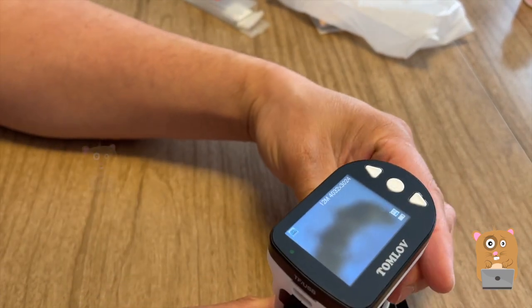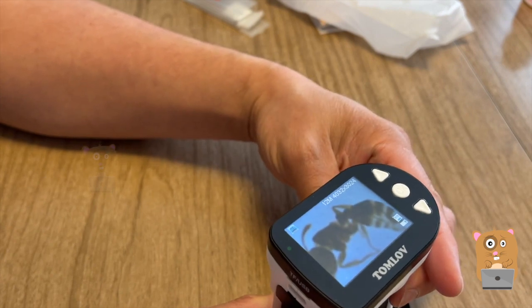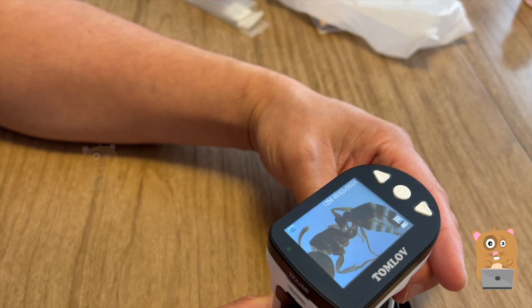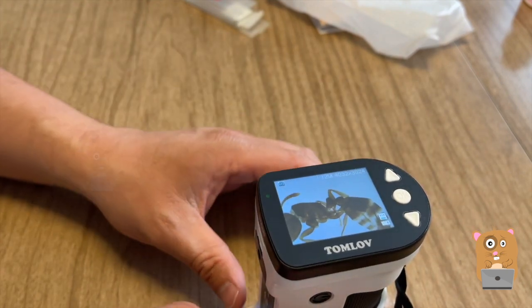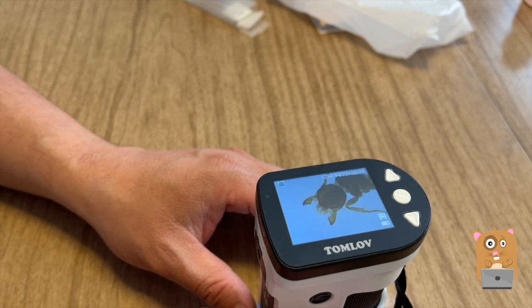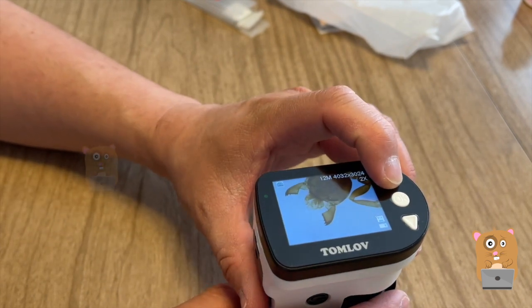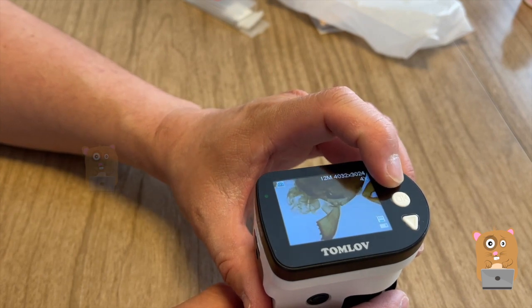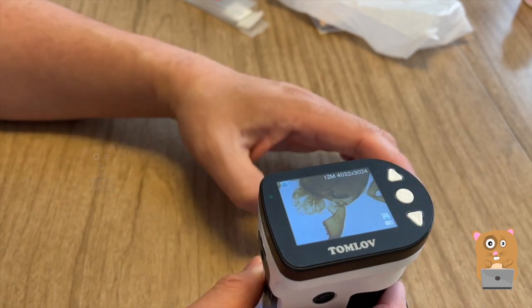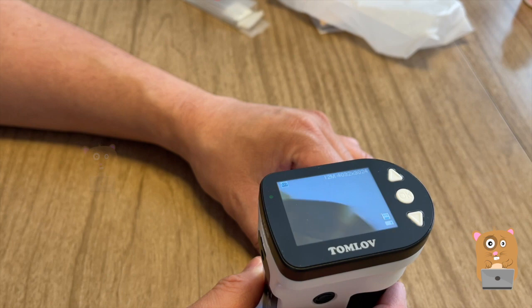I'm just turning the focus ring here. Wow, this is pretty neat. Let's see what these buttons are for. So what it says is 800 zoom — it's basically digital zoom. But still, it's pretty neat.